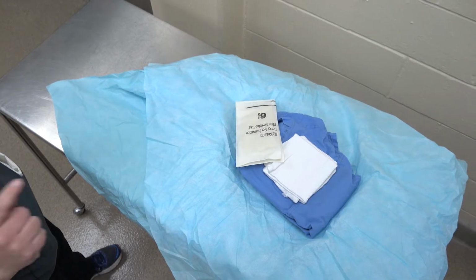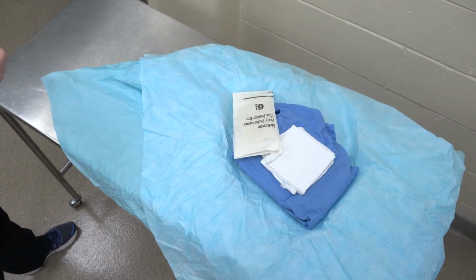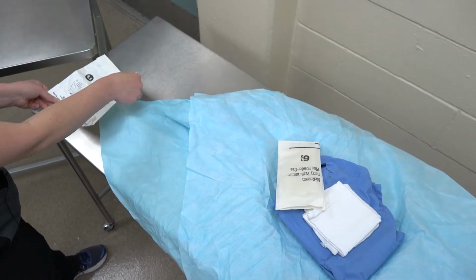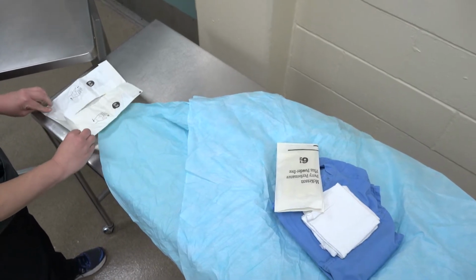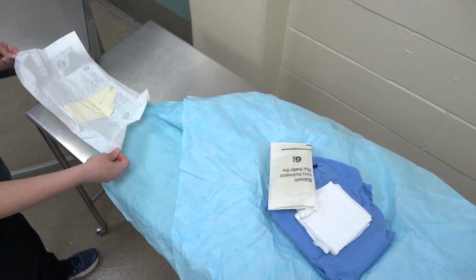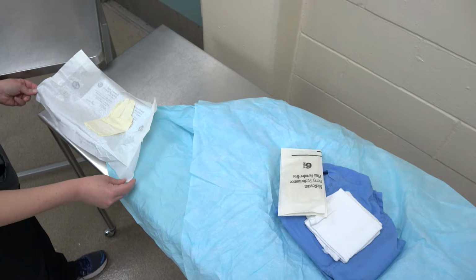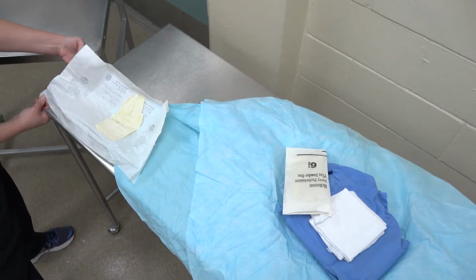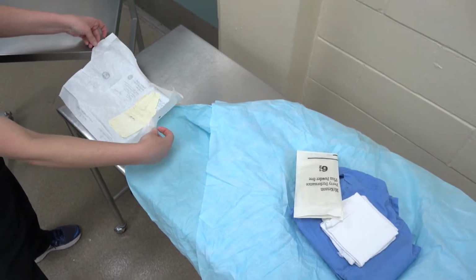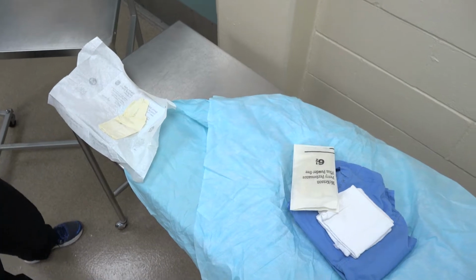Now alternatively, if you don't want to manipulate that package with the sleeves over your fingers, you can open your gloves on the outside or next to your pack by opening them again sterilely. So I'm only touching the very outside of my package. And you notice I'm doing this well away from my gown because this is all dirty. Now that I've touched it, it's dirty. So I'm preserving the inside of the package. Apparently in this package, one of the gloves is missing. That's okay, we just get you another set. And we're gonna make sure that it stays open because if it closes again, that is not ideal. All right, sometimes bending this portion under here helps it to stay open. There we go. So that would be the alternative way.